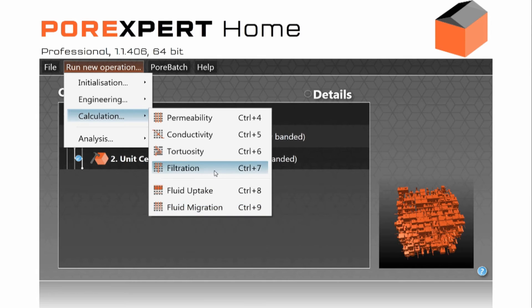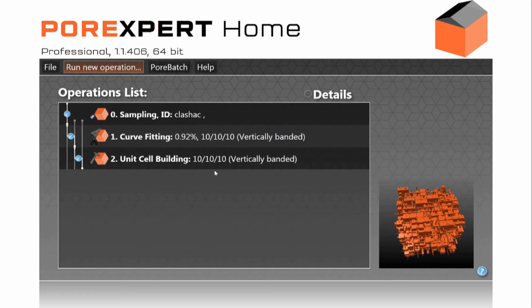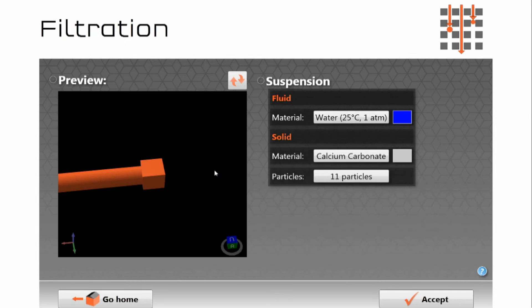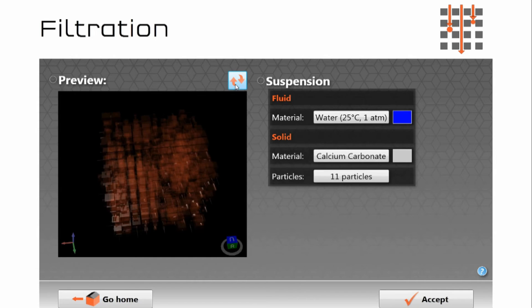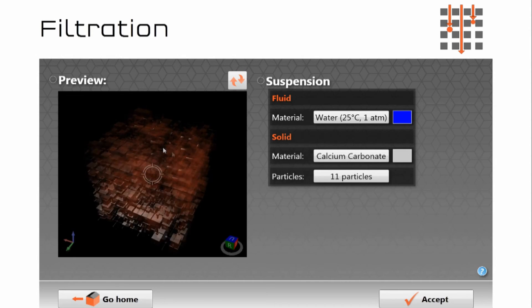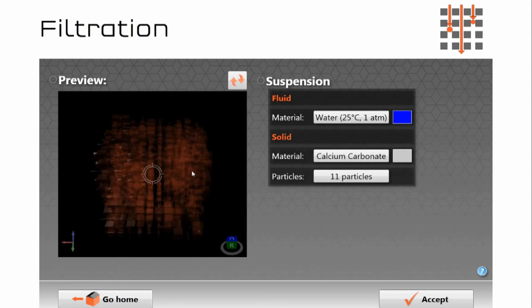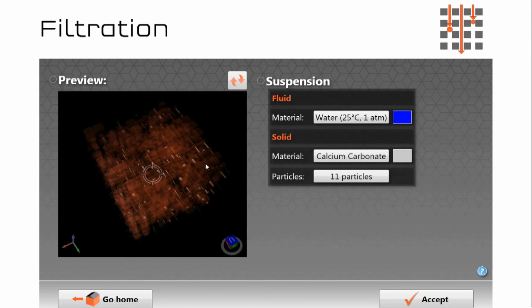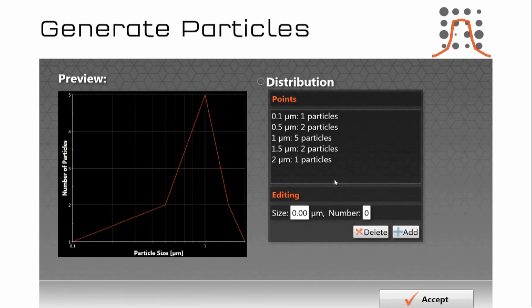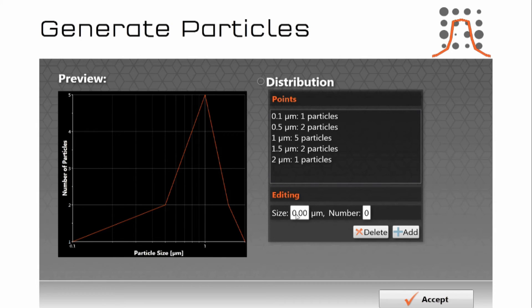So here we have a sample. I'll just refresh that so you can see the entire sample. So there is the structure and here is the particle size distribution which we can see. So this is just a default distribution. I'm going to add some larger particles into it now.